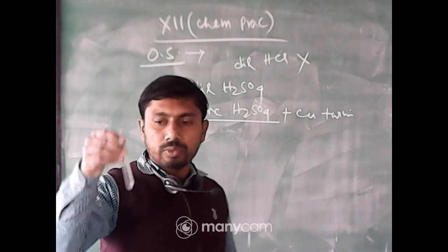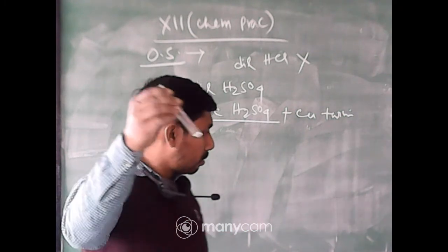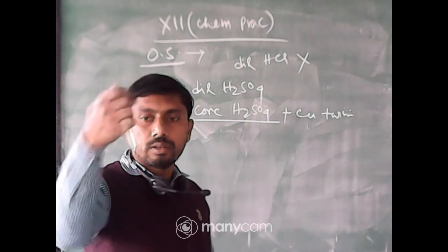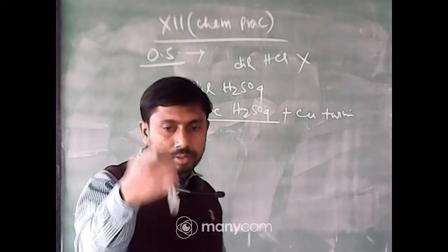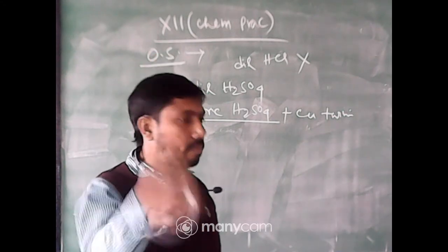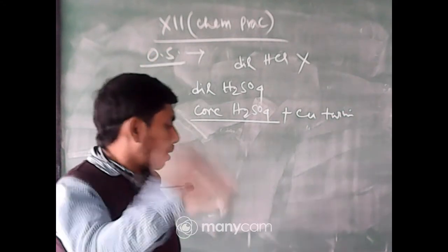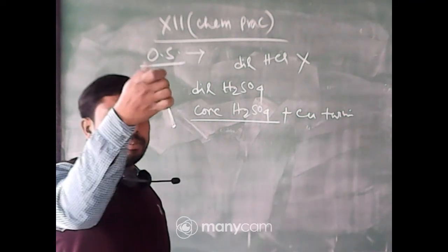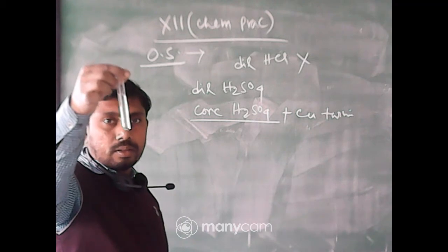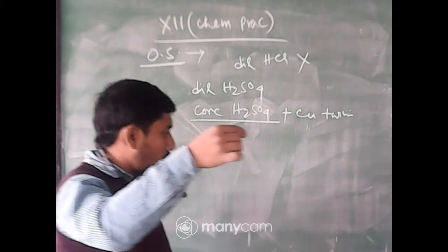Now shake it well, till the total sample becomes soluble. Now the total sample is soluble here.